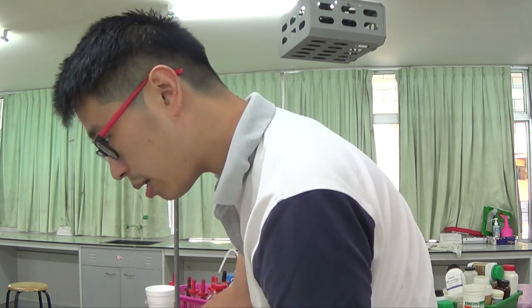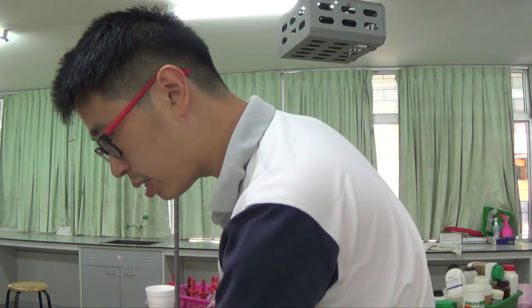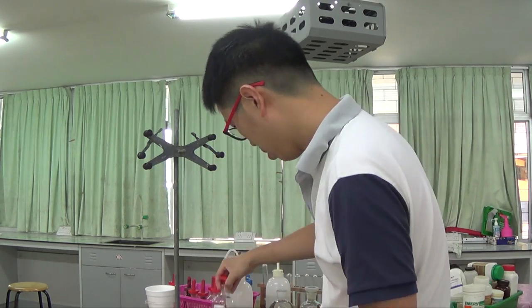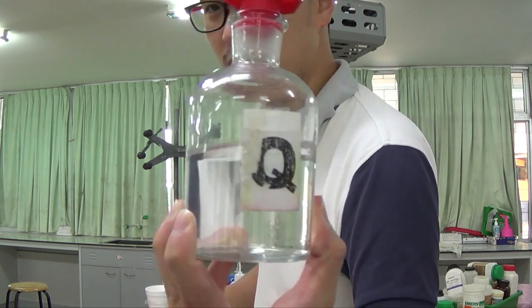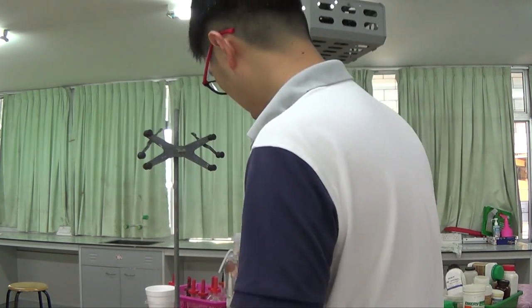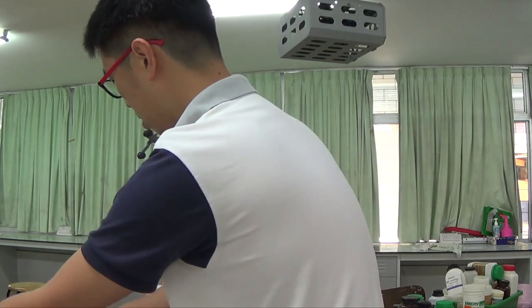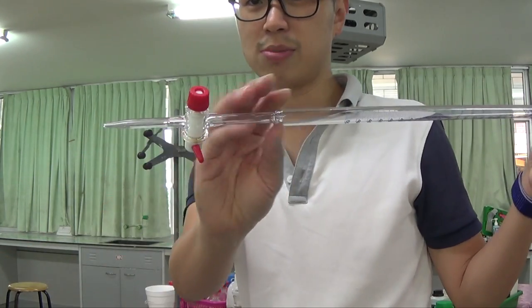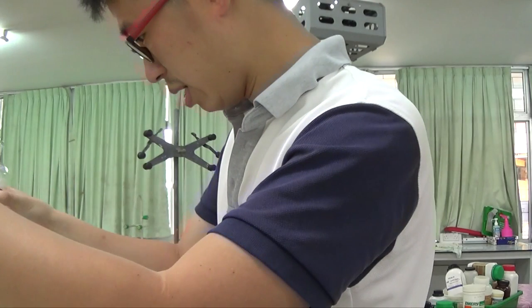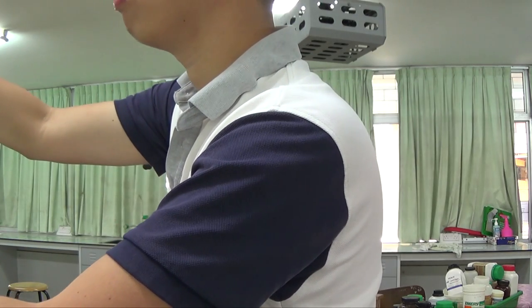Alright, so talk about pipette, talk about burette. So Q is standard sulfuric acid. Sulfuric acid into the burette. So this is mark Q, and this is the P. So Q is the burette. So I want to fill it in first, but I want to rinse it first. I close the tap. We have the sink. Q into burette.